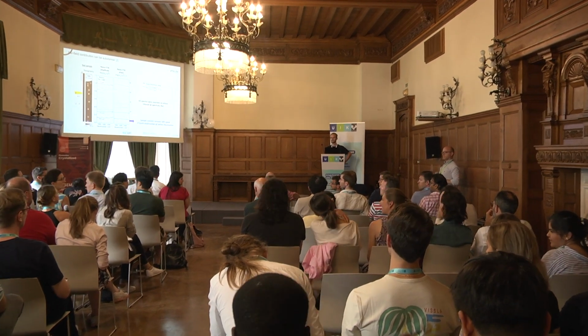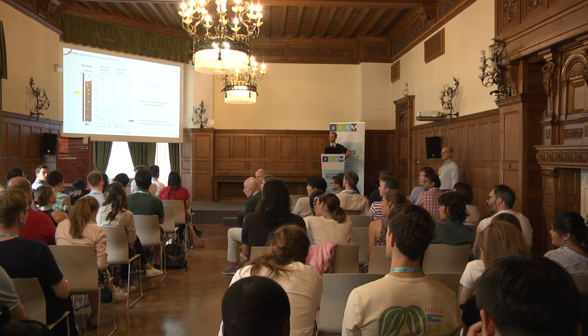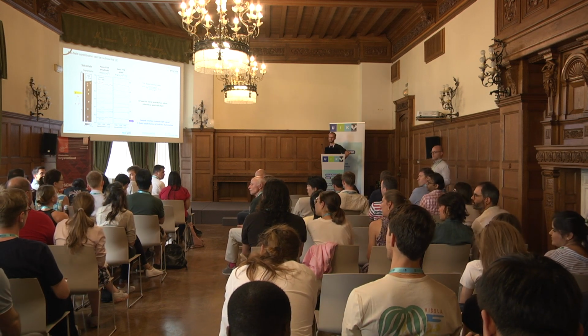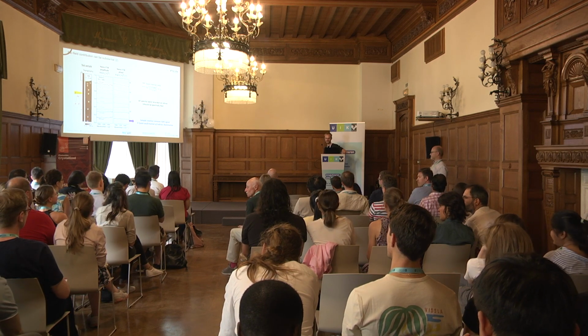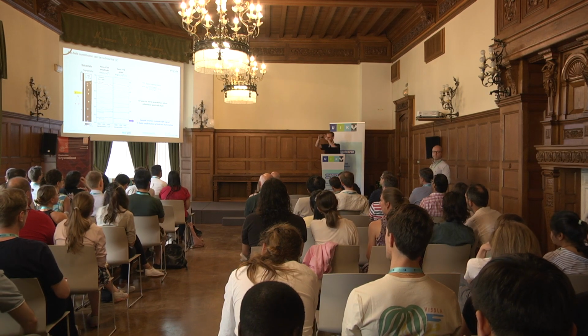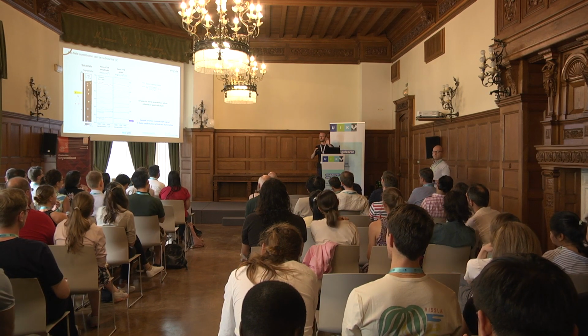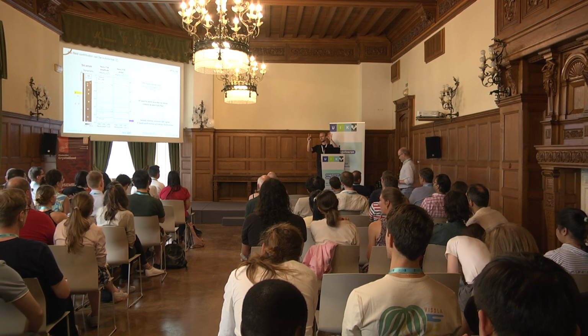You said we can use the higher harmonics for the normalization, but you also recommend using a reference sample. So what might be the problem? What Fritz showed was a very broad spectrum, and then there were water lines, many small peaks, and 2 sharp lines.